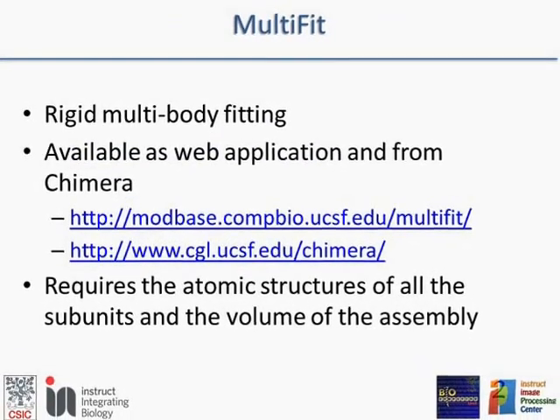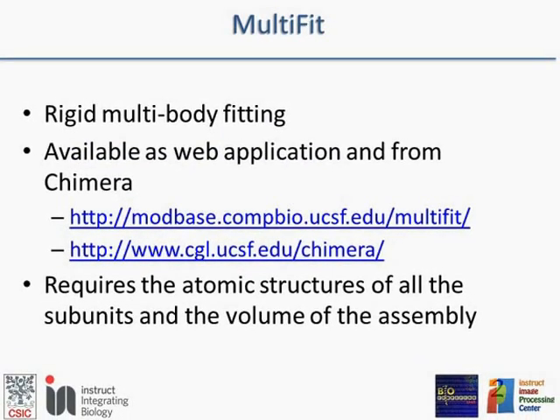Multifit is one of the algorithms that I'm going to show you. It is included in the standard distribution of Chimera. Before, it was a plugin, but now there is no need to make an external installation. It's a program to perform multi-body fitting.